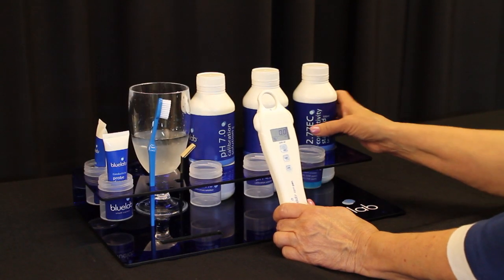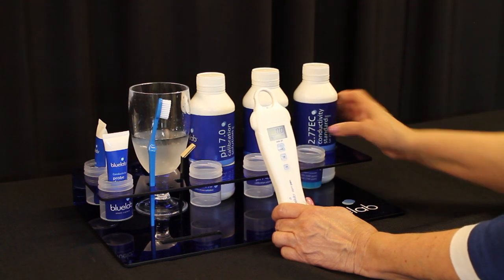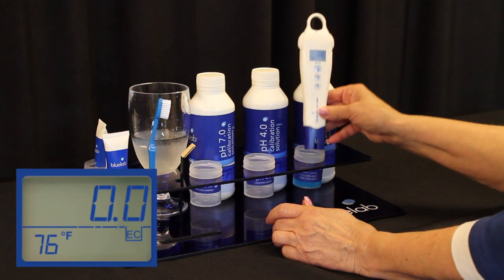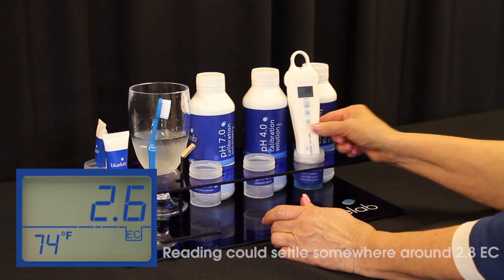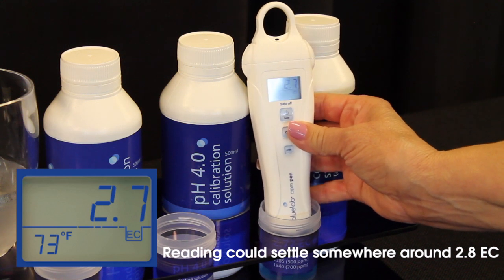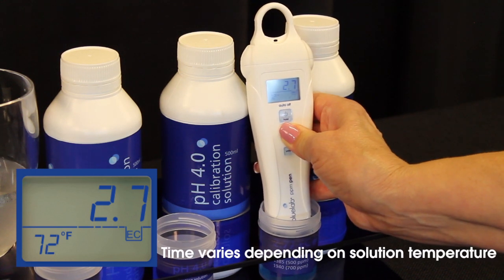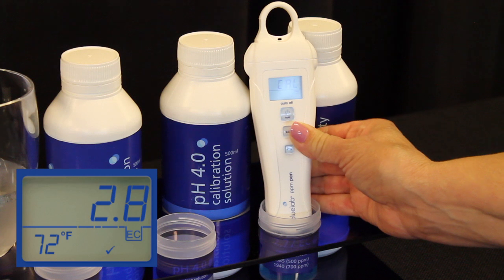Calibrating your PPM pen: only use Bluelab calibration solution to make sure that your pen is calibrated correctly. Set your pen to EC. Place your pen in Bluelab 2.77 calibration solution and wait until the reading stops moving — this may take a minute or two. Press the cal button down on the pen while it's in the solution and wait until it says 'Cal' on the screen.